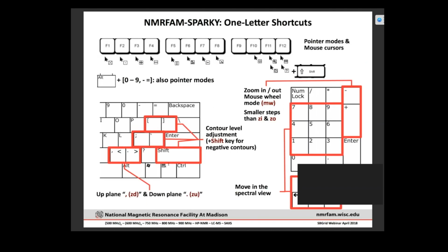And there are one-letter shortcuts. Sparky is very popular because of its efficient 2-letter shortcuts, where you can access all the features by typing 2 letters. And even more, you can just use 1-letter shortcuts in certain tasks, which is useful for using 1 letter instead of 2 letters.